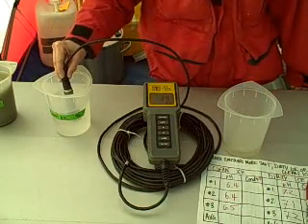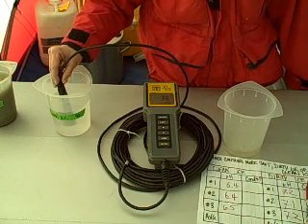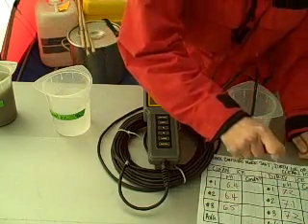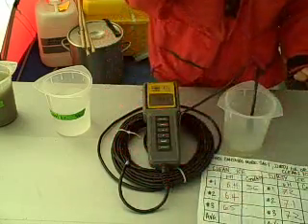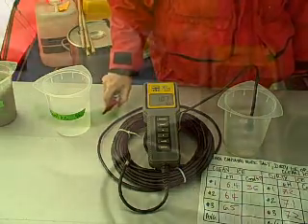So I stick the probe in the clean ice. So we are going to put 36. So 36 microsiemens for the conductivity of the clean ice.